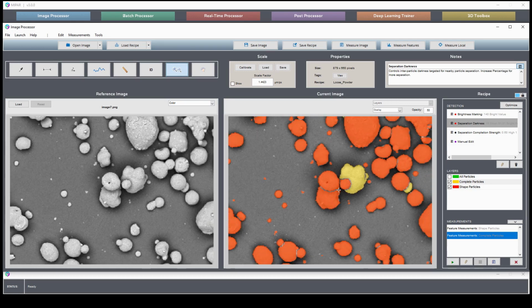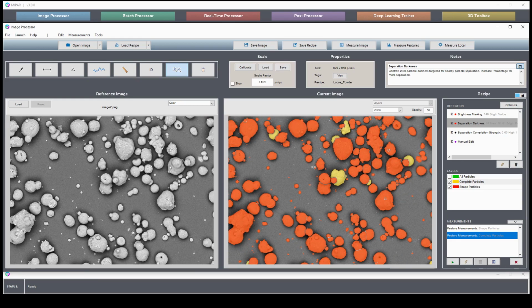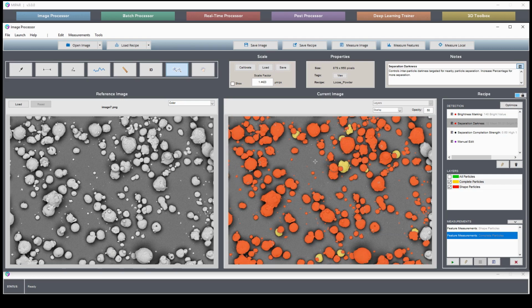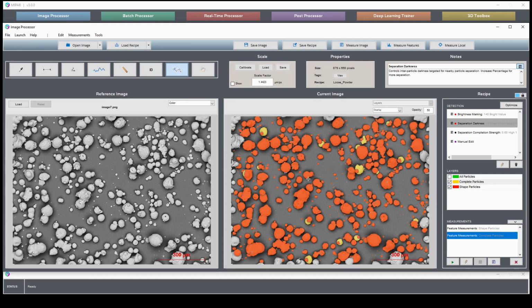And this allows me to mention a very key component of MIPAR solutions in that they are almost always customized. We don't view customization as an afterthought. In fact, most of the solutions that our users build for themselves, or ones that we help them build, are built for their particular problems to address their particular challenges. The nature of MIPAR's recipe building environment, especially with the deep learning technology, allows our team and our users to effectively and quickly put together custom-built solutions that really work for them.